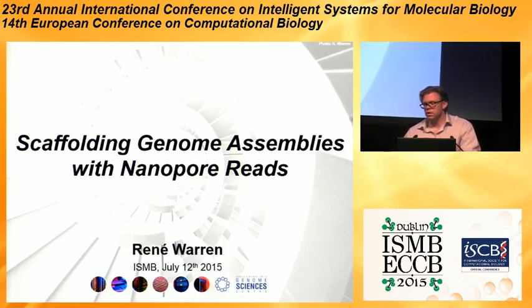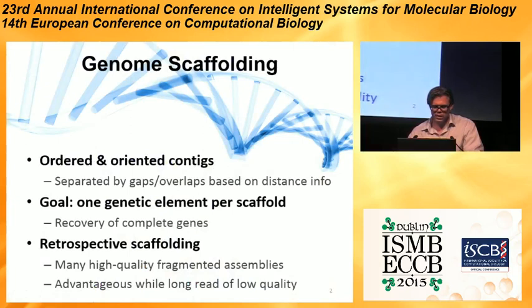So I'll be focusing on two aspects during my talk. The first part will be describing the method, and the second part will be giving you some examples where we've used this technology with long reads from different sources, not just Oxford Nanopore.